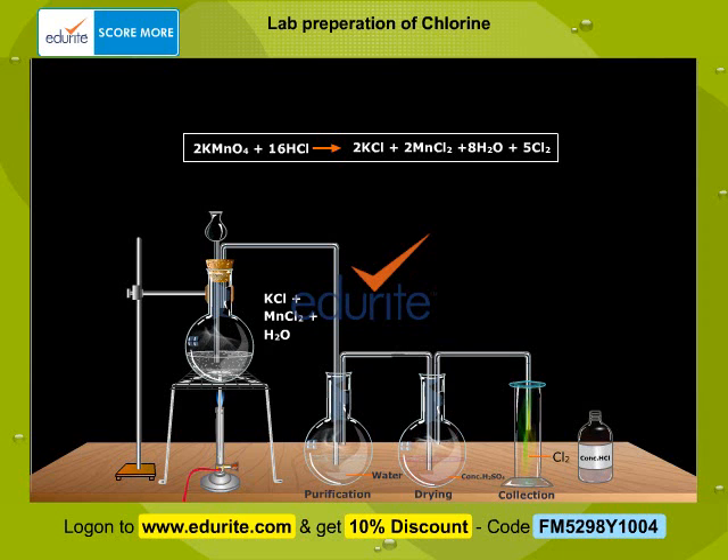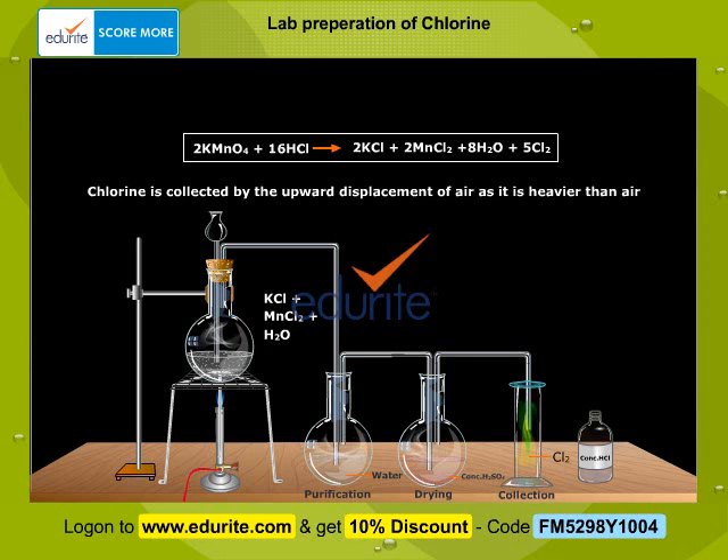The products of the reaction are water and chlorides of potassium and manganese, which are left behind in the round bottom flask. Chlorine is collected by the upward displacement of air, as it is heavier than air.